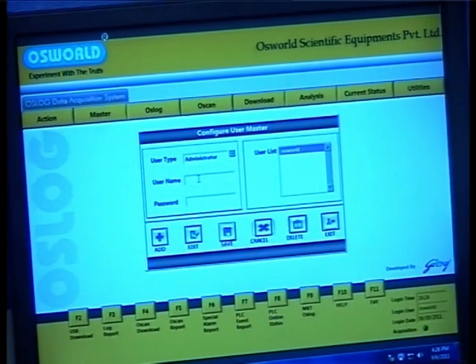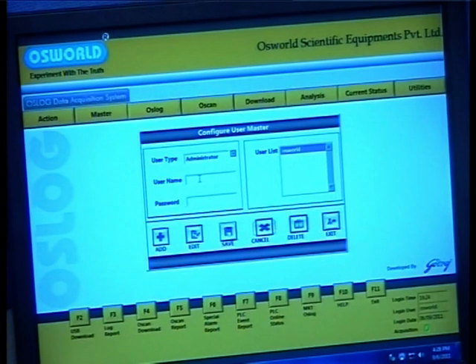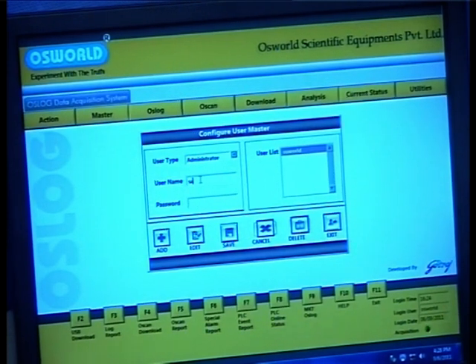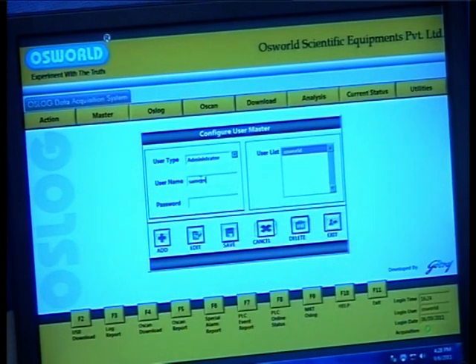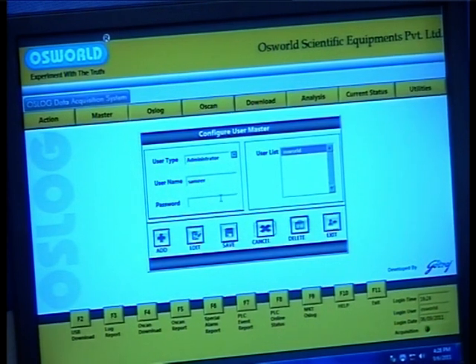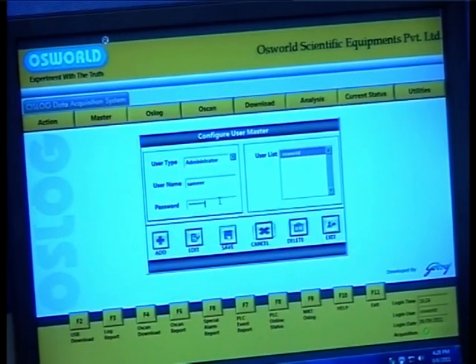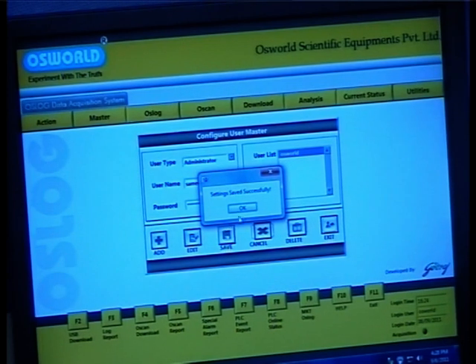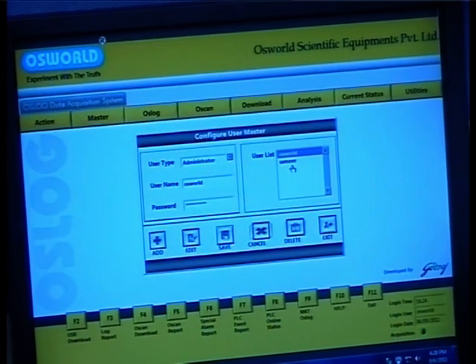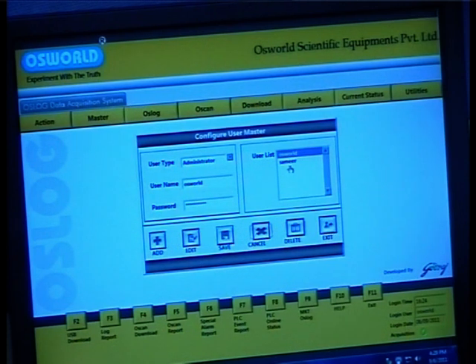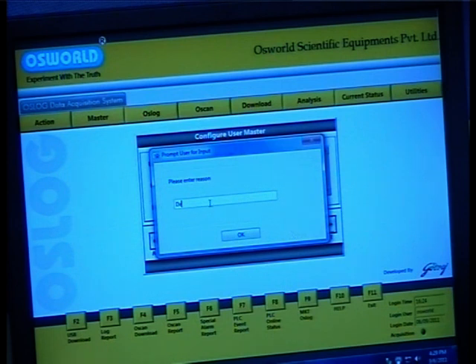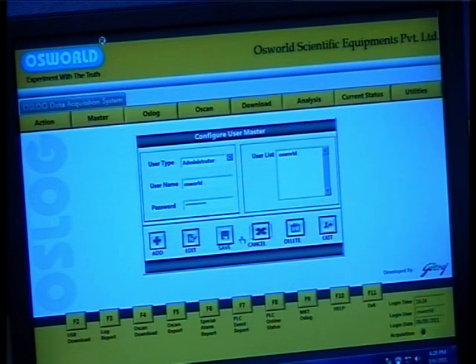On addition of a valid reason, you are now able to enter a user type which could be an administrator, a super user, or a guest. Once the user type is entered, you may enter a new user name and password for the new user. Hit save and the new user's name shows up in the list of users. Similarly, if you want to delete a particular user, select the user's name and hit the delete button. Enter a reason and click on OK.